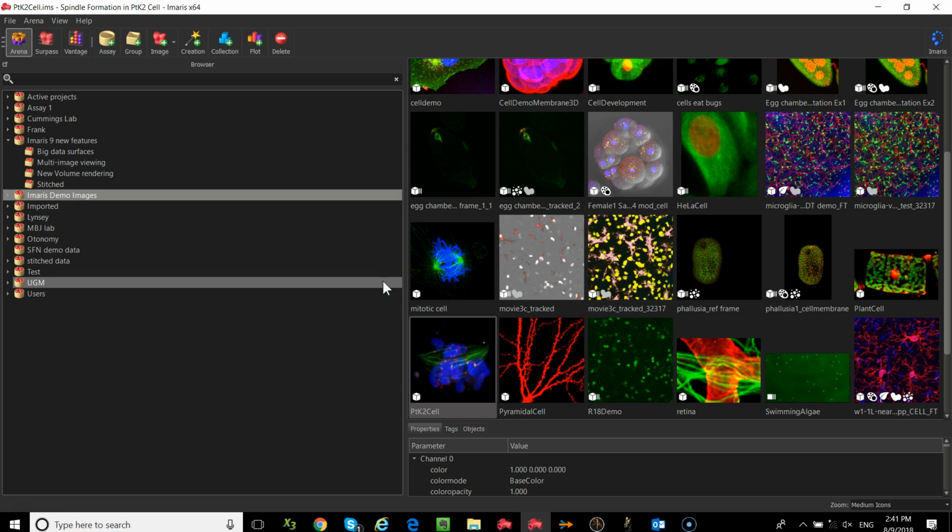Okay. So was your system weird? Just missing, like, was it just the... Oh yeah. Yeah, it had the bar and it had the color. Okay. Yeah. And you're right, for movies it would look weird, but it just wasn't there. If it was simple toggles. Yeah, it should be there. I have to tell you, I'm so used to using PC that whenever weird things happen... I'll report it. It might just be a little.